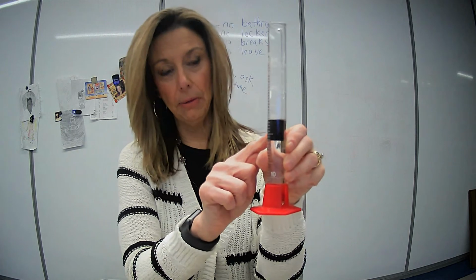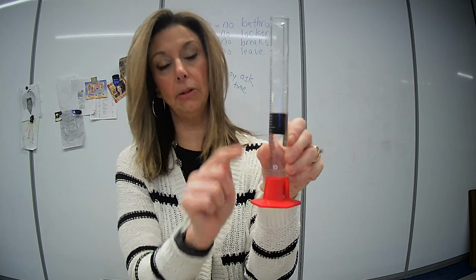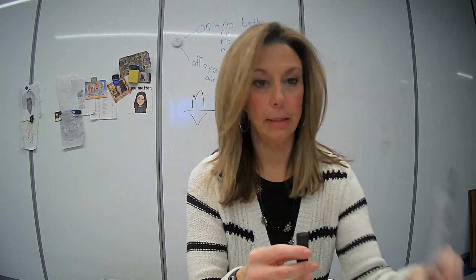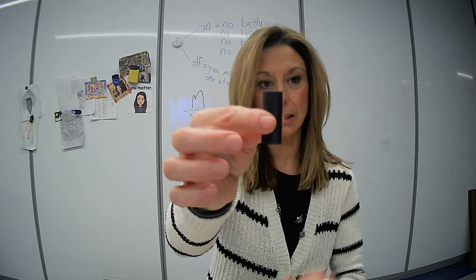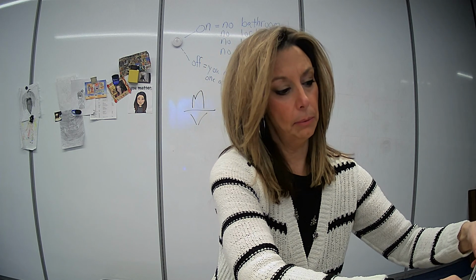All right. Now I'm going to dump out the graduated cylinder in the water, and then I have to refill the graduated cylinder with 25 milliliters, and then we'll do the second one. All right, so I filled it up again with 25 milliliters. This time I'm doing the second size in the tube. We'll drop it down.